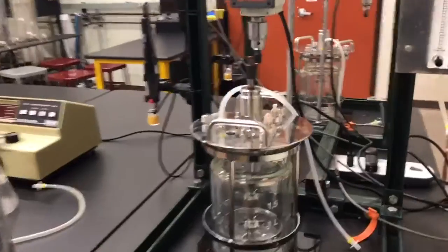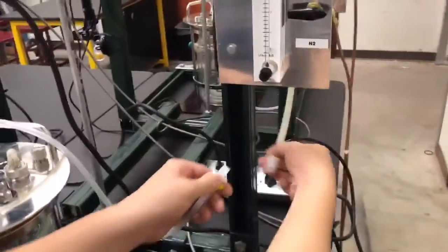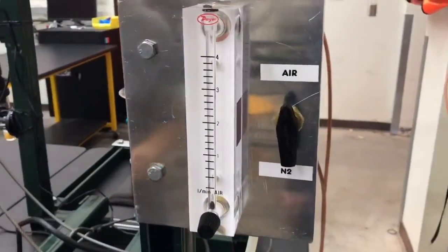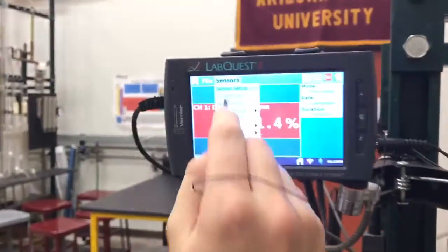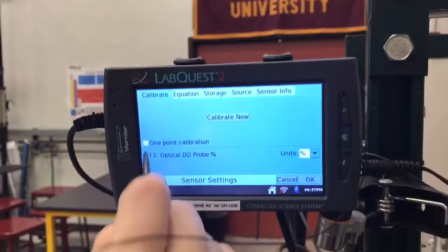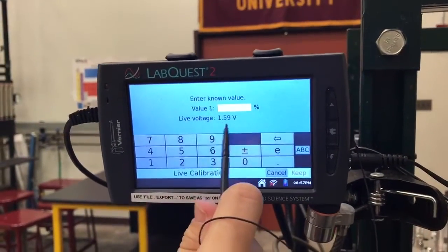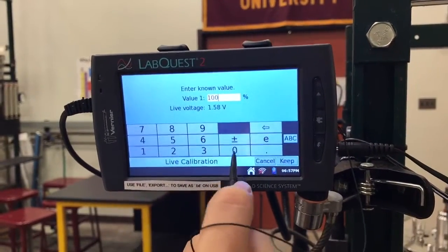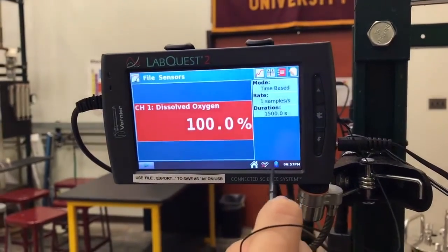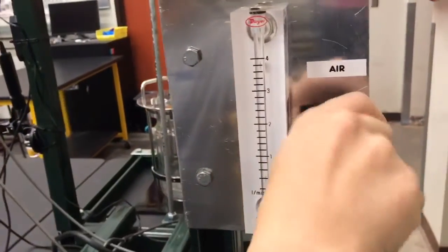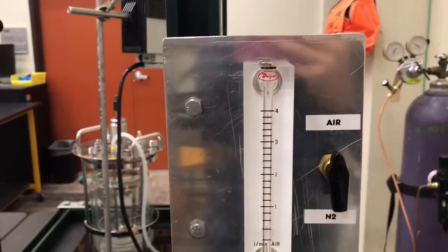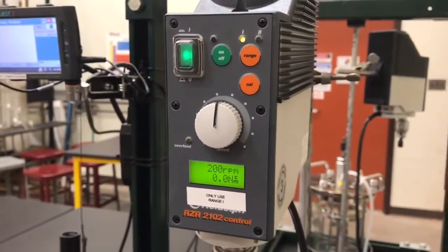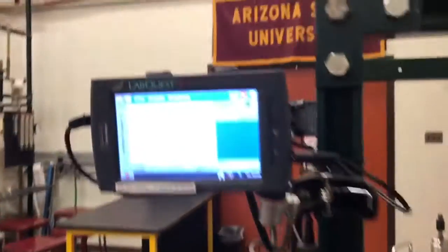For the static method, fill the reactor with two liters of water and connect the airflow. Before starting, calibrate the DO probe by placing it in the reactor while it's being aerated. In LabQuest, choose Sensor > Calibrate, select the optical DO probe, and choose one-point calibration. Wait until the value levels out, then enter 100% as the maximum value. Next, outgas the system by switching flow to nitrogen; once dissolved oxygen reaches zero percent, start recording, turn the air back on, and set airflow and agitation rates to the chosen parameters. Once the value levels out, the run is complete.